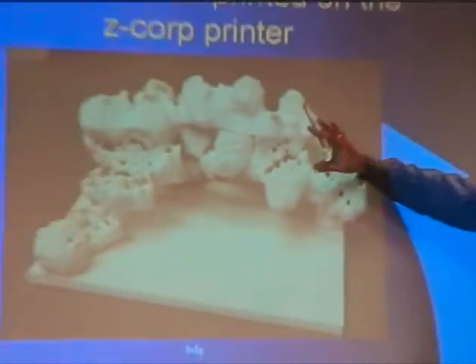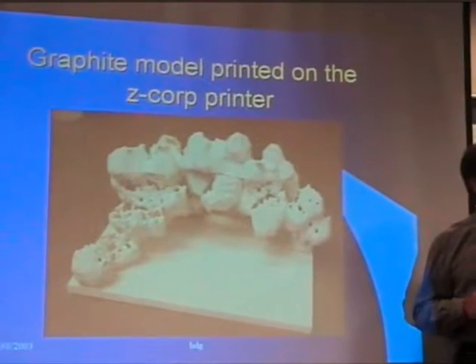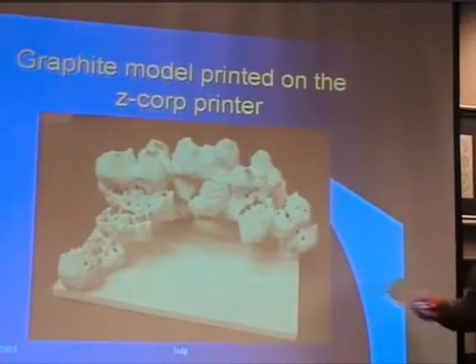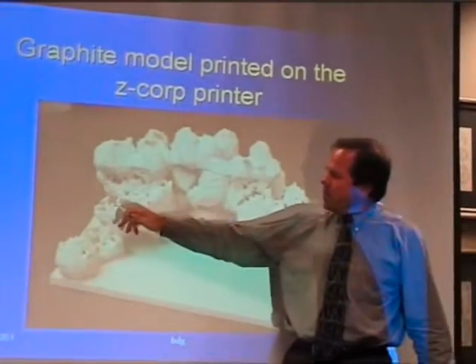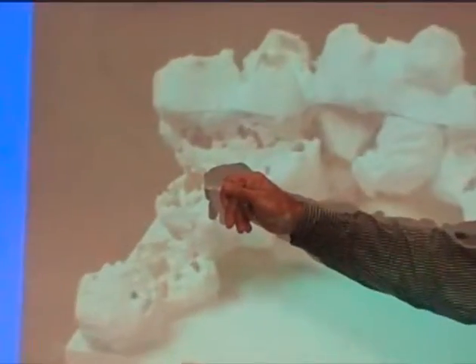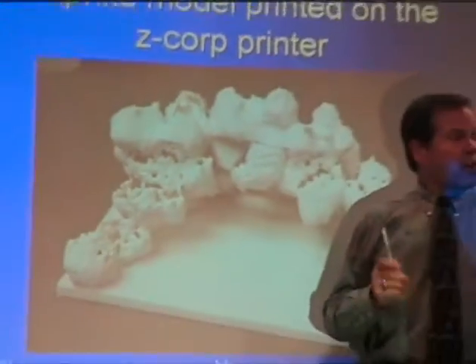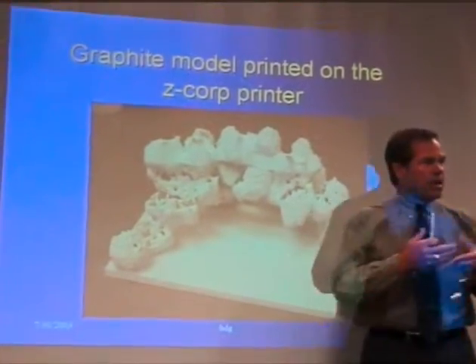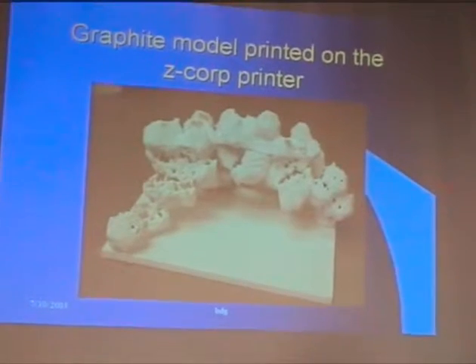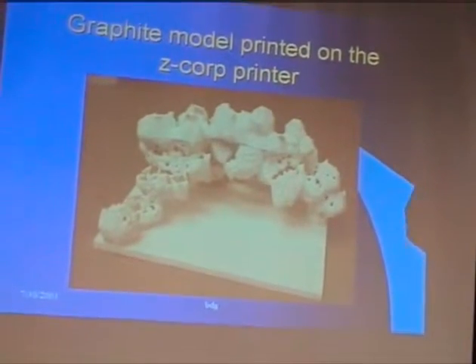And it looks to me like we could have a really good time using this kind of system to characterize our catalysts and our porous materials at the nano level. So we're very, very excited. The next piece is, if we had a catalyst particle sitting in here, we'd like to know how big that is. Okay? And so that's what I think we're going to learn when we go to the nanotubes. We'll learn if we can get a second material imaged properly. And I think we can do that. I think we've got another picture of this as well.